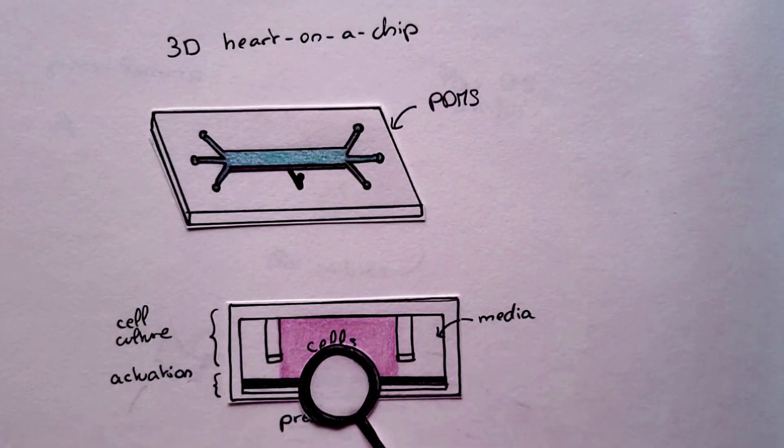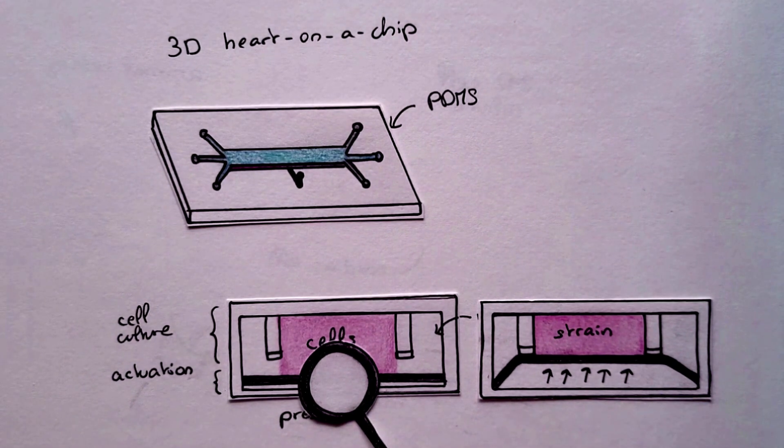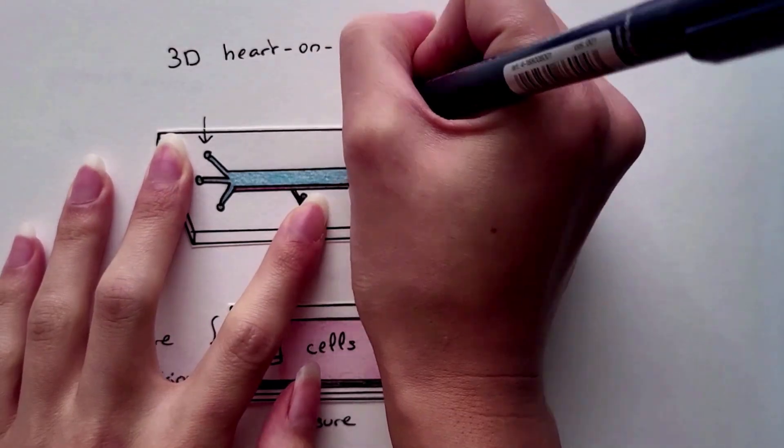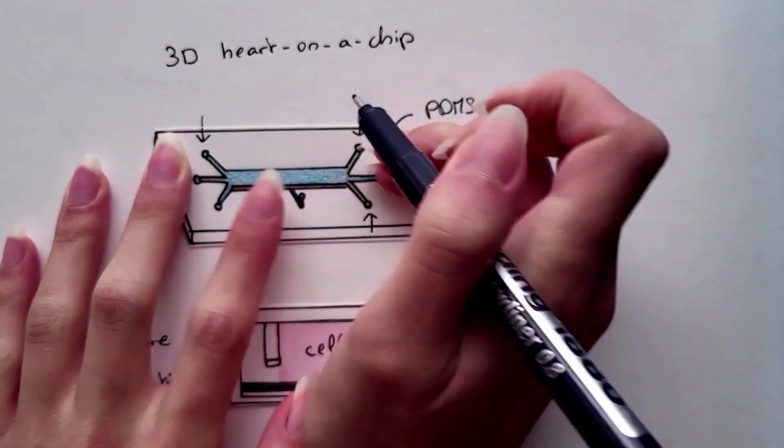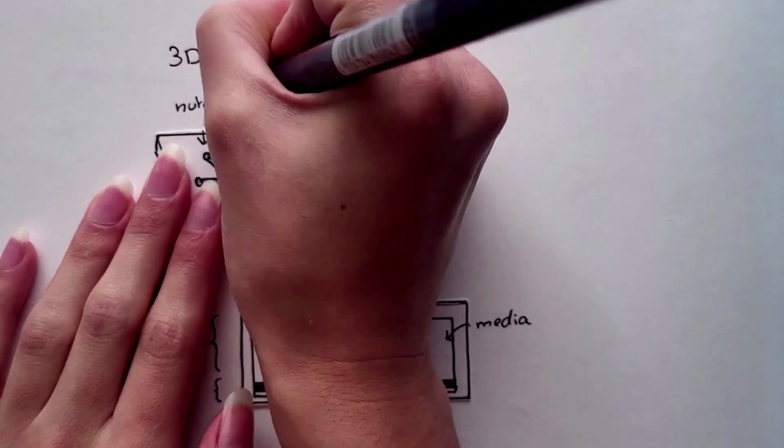We also need to add microactuators. For example, to send electrical signals or to implement mechanical stimulation to provoke beating and pumping. And finally, we also have microchannels going in and out of the chip to provide the cells with nutrients and oxygen.